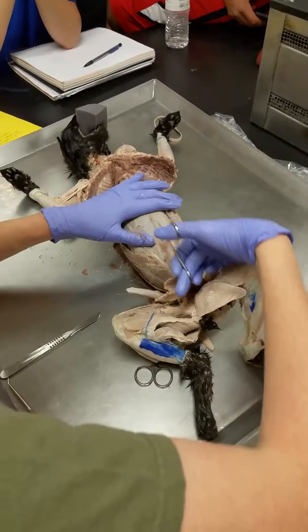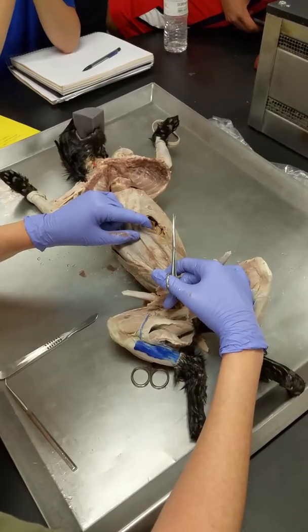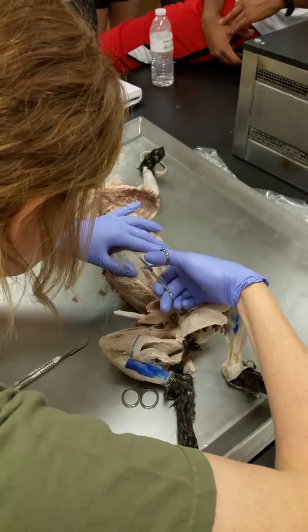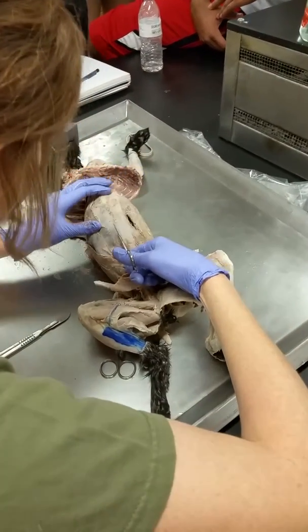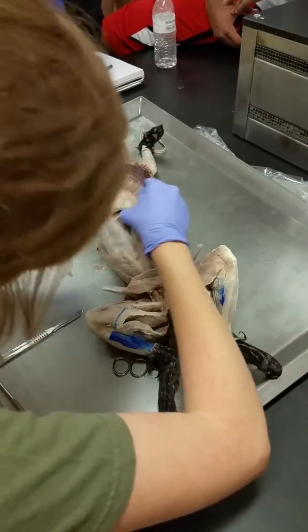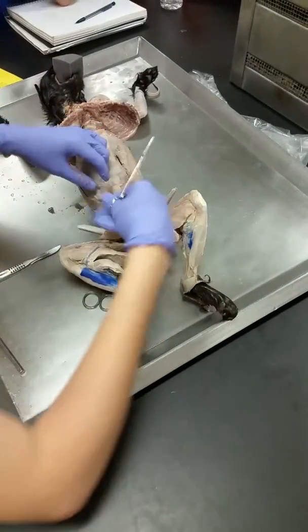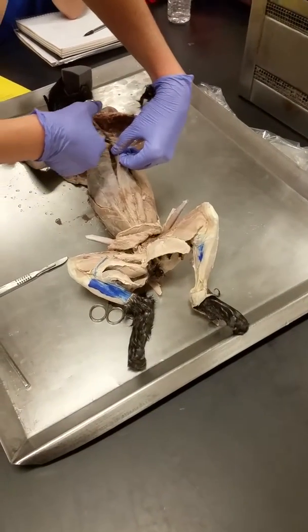So again, just take your scissors. If you want to, you can use this hole here and just cut it open right there. I don't like to. I like to have symmetry. There we go. Okay. And we're just going to cut a window in this the same way, but we want to keep the diaphragm alive. So then I'm going to cut down on the sides.